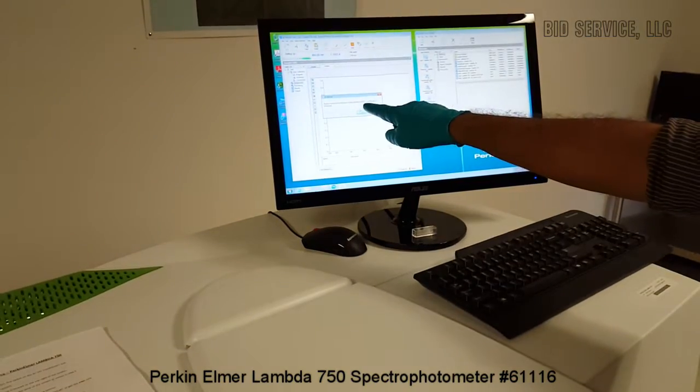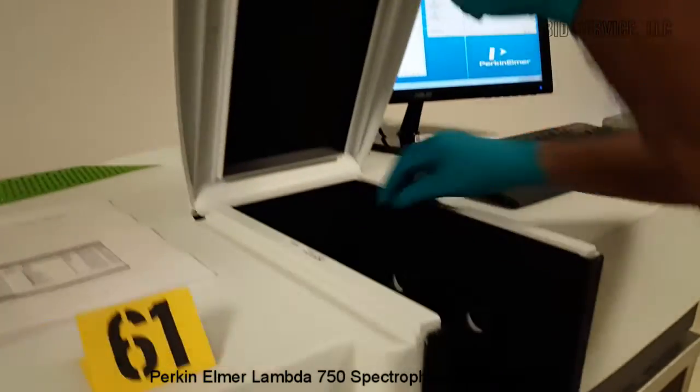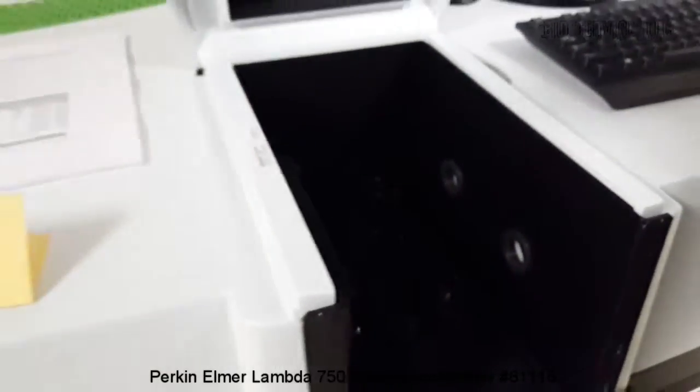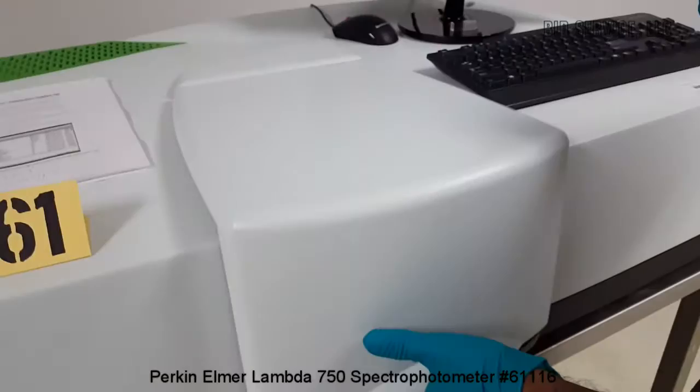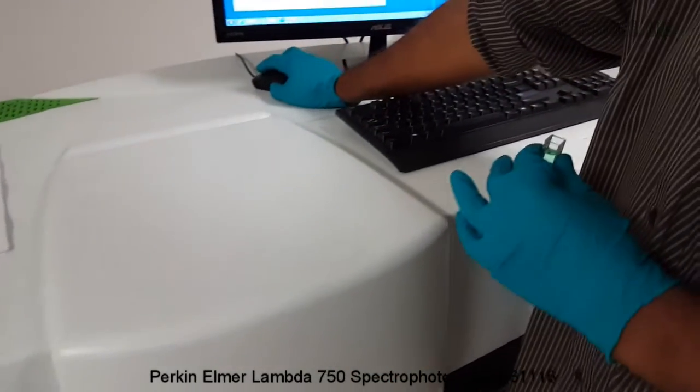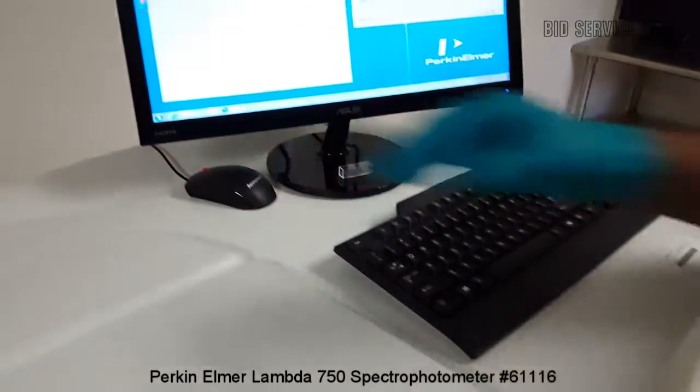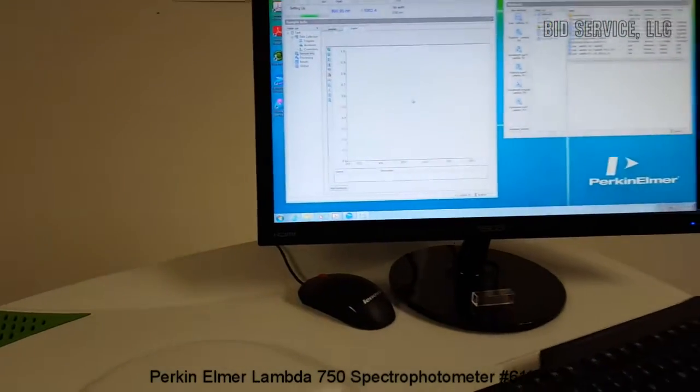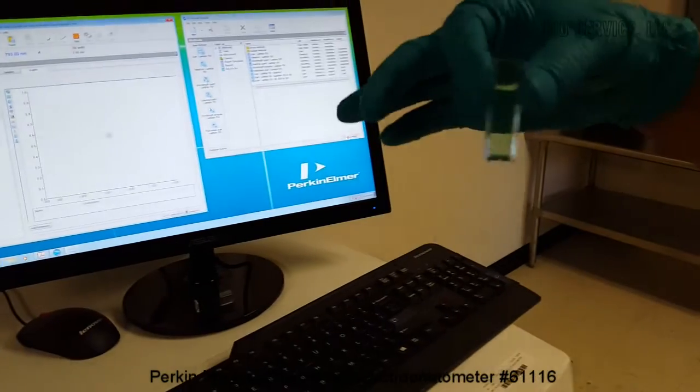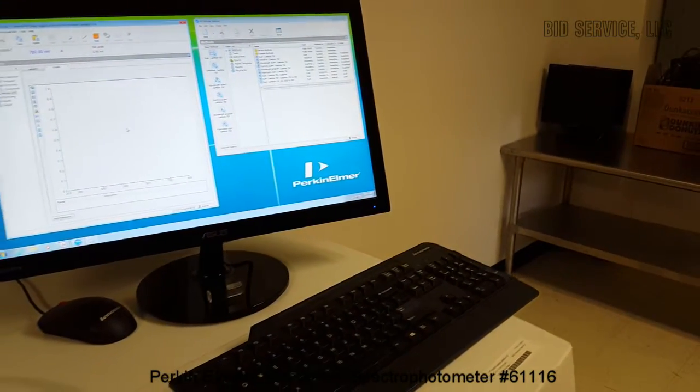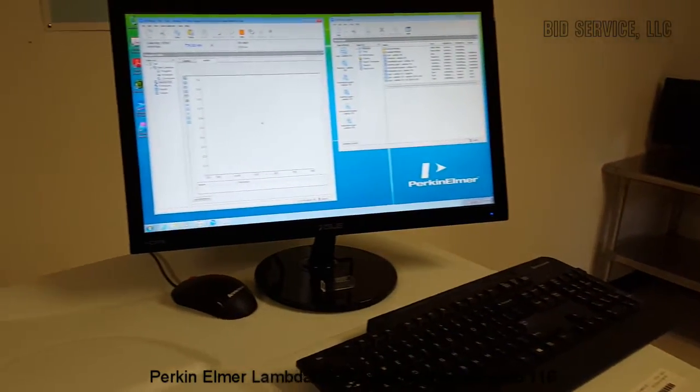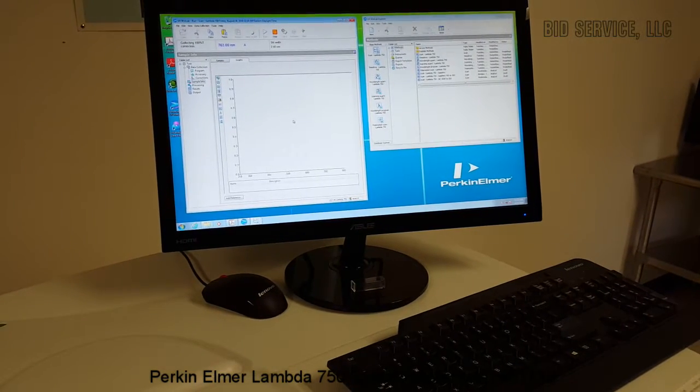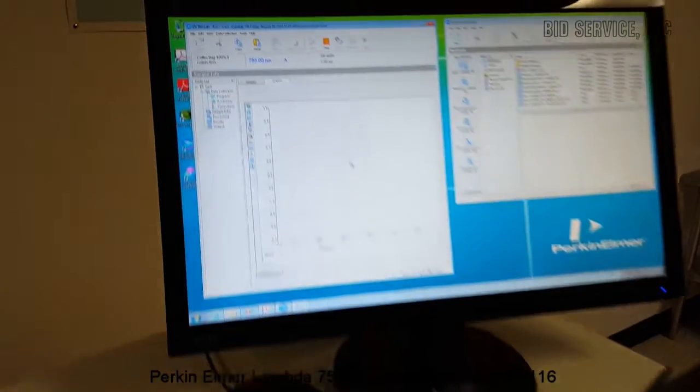So once the system is selected to run a sample, the unit will start setting it up and a window will pop up prompting to remove the sample so that it will perform 100% transmission. So here's a sample compartment and I have a previous sample. So we remove it and then press OK.